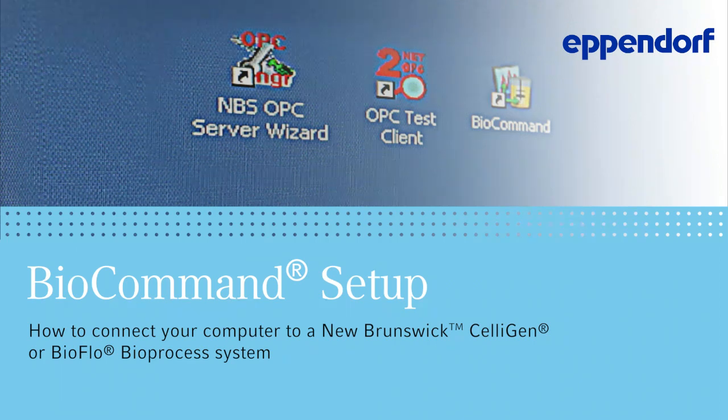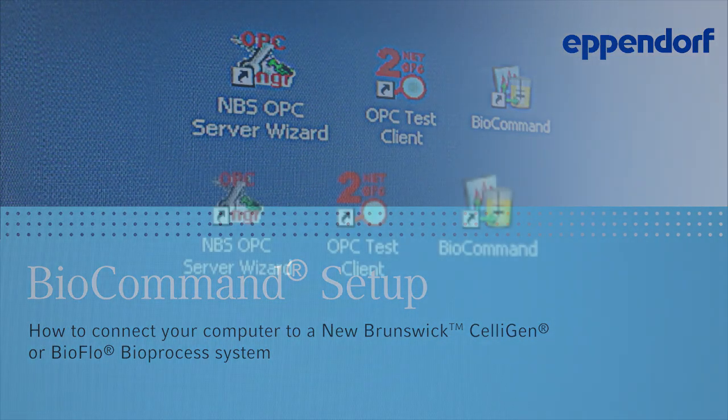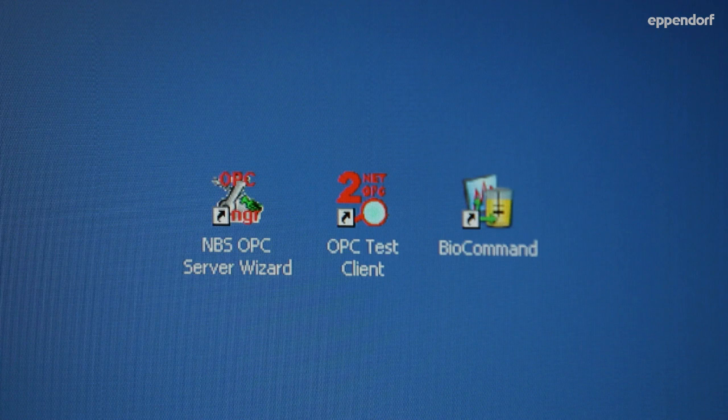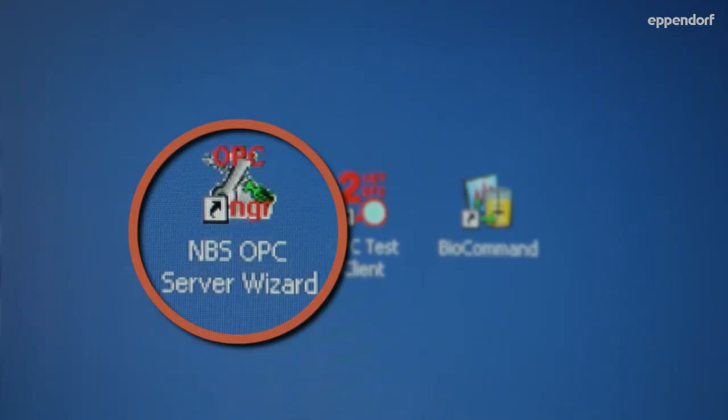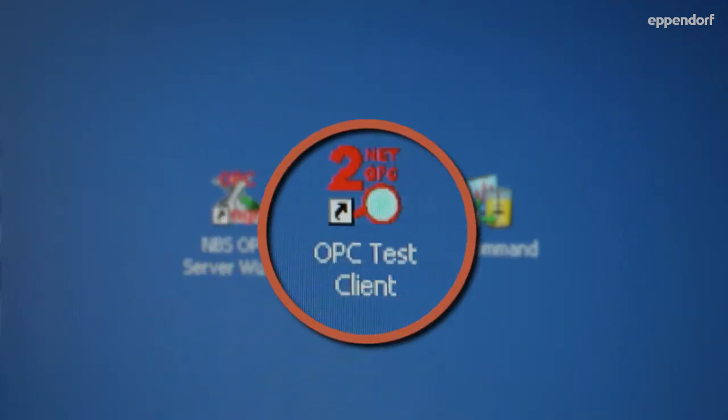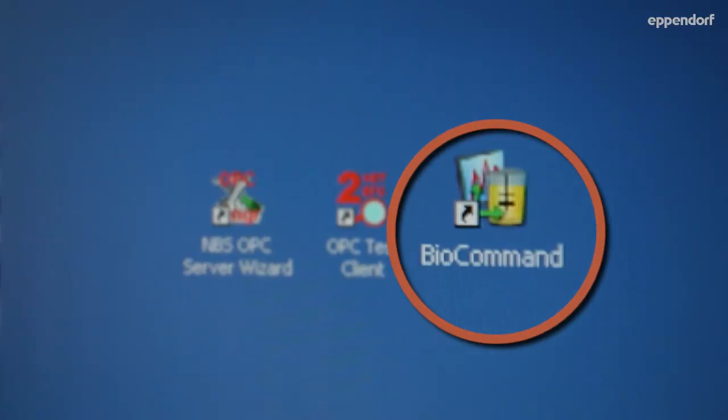Before making any hardware connections, be sure that the BioCommand software is properly installed on your PC according to the operating manual provided with the software package. There are three parts to the software: the OPC Server Wizard, the OPC Server Test Client, and the BioCommand program itself.